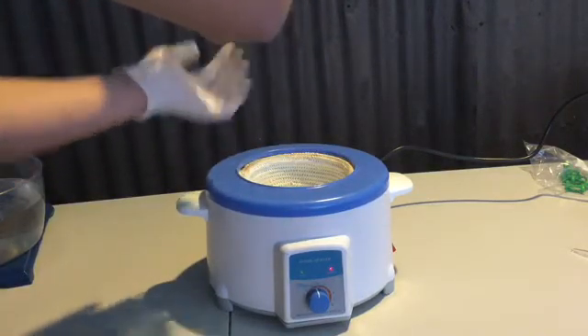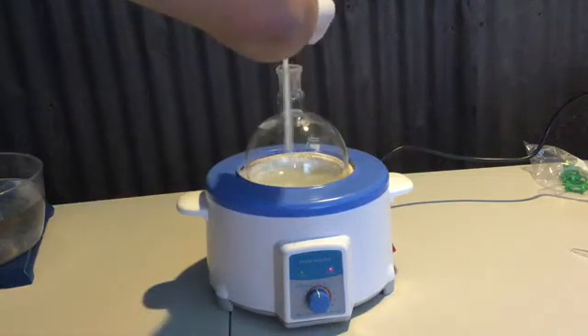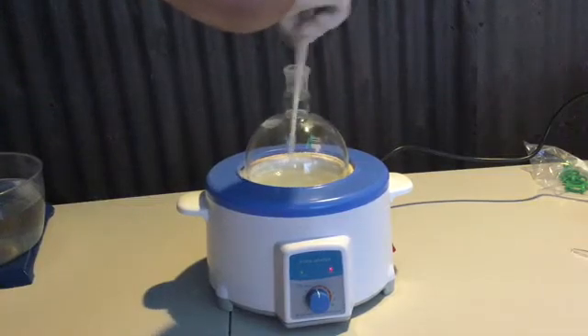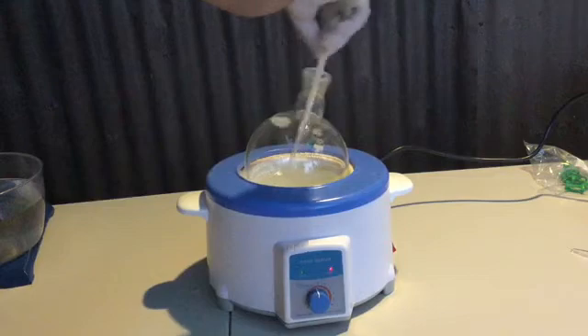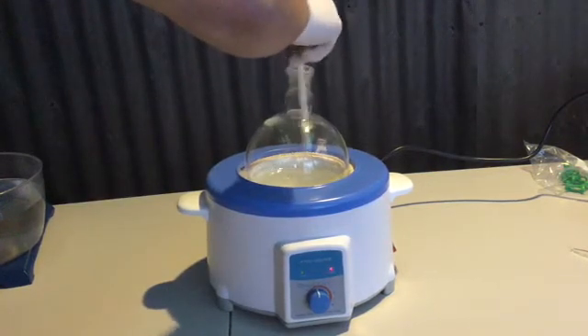I'm occasionally feeling the bottom of the flask to check the temperature — it was very hot. This is a boiling flask and it should be able to withstand the heat. However, I did not want the heat generated by the heating mantle and the dissolution of sodium hydroxide to become high enough that it would actually vaporize the water.